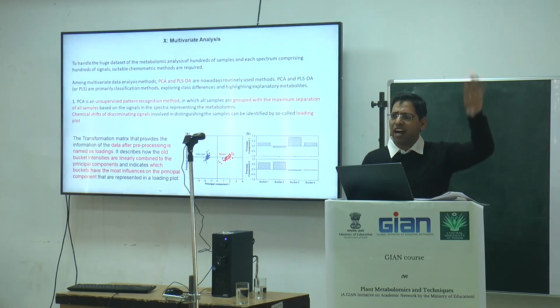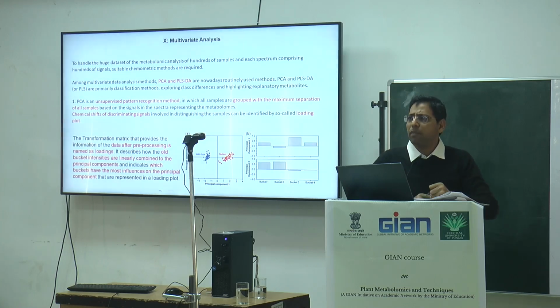Data is everywhere, some up-regulated, some down-regulated, but if you are not using chemometrics, how can you know that it is really up-regulated or down-regulated? This multivariate analysis is very common; you will find it in all the papers you read on genomics, metabolomics, transcriptomics, and even physiological data.